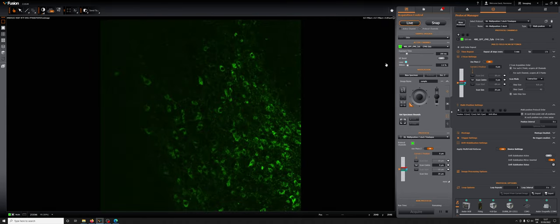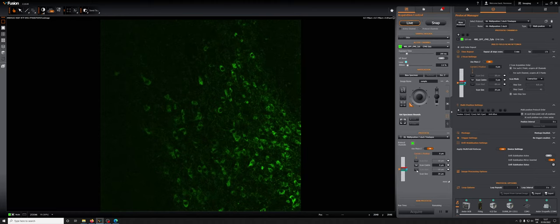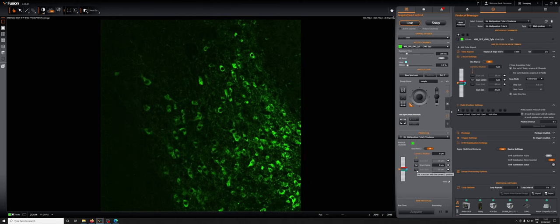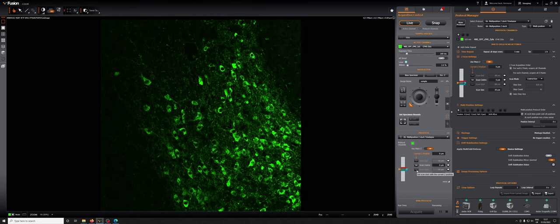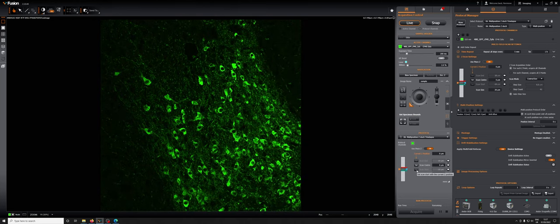The key thing here is we are not going to use the piezo to focus, so we're not going to drag this to focus. Instead, we're going to physically move the focus knob on the microscope. There's no way for you to see what I'm doing, but just trust me that I'm moving the focus knob on the microscope.